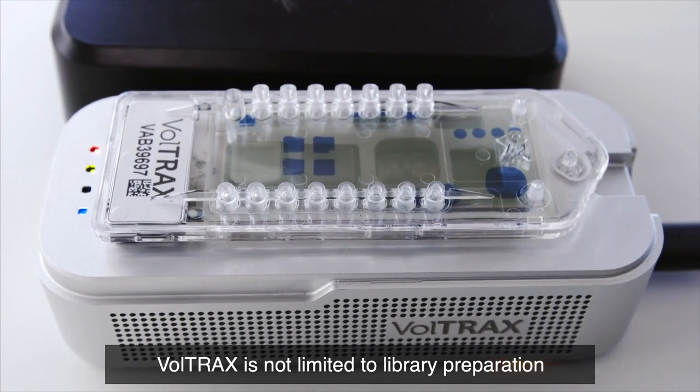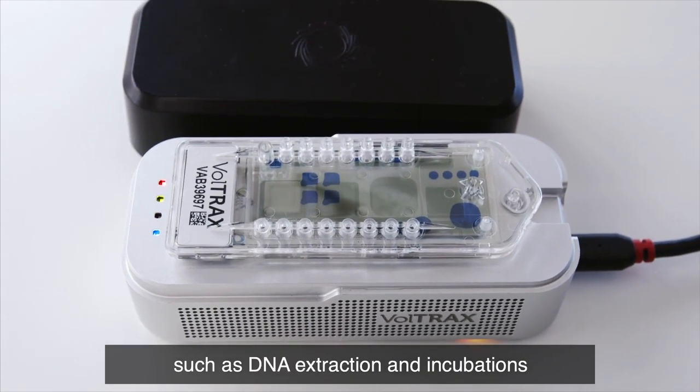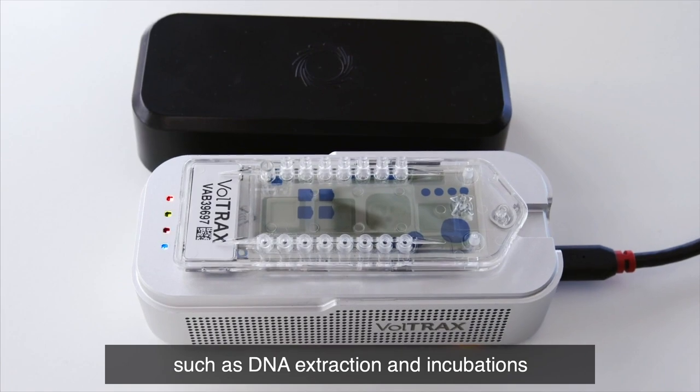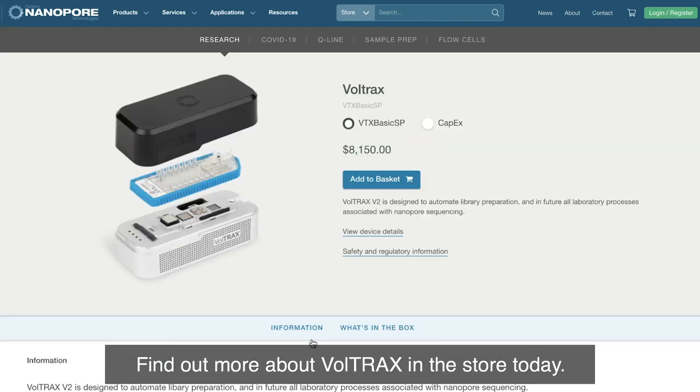Voltrax is not limited to library preparation, and users are able to explore other areas such as DNA extraction and incubations at different temperatures. Find out more about Voltrax in the store today.